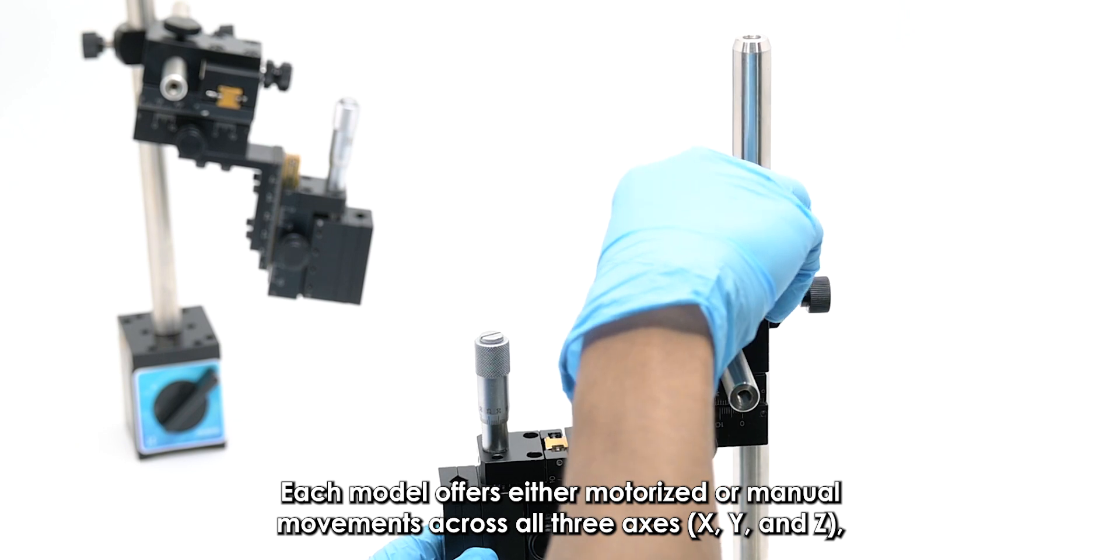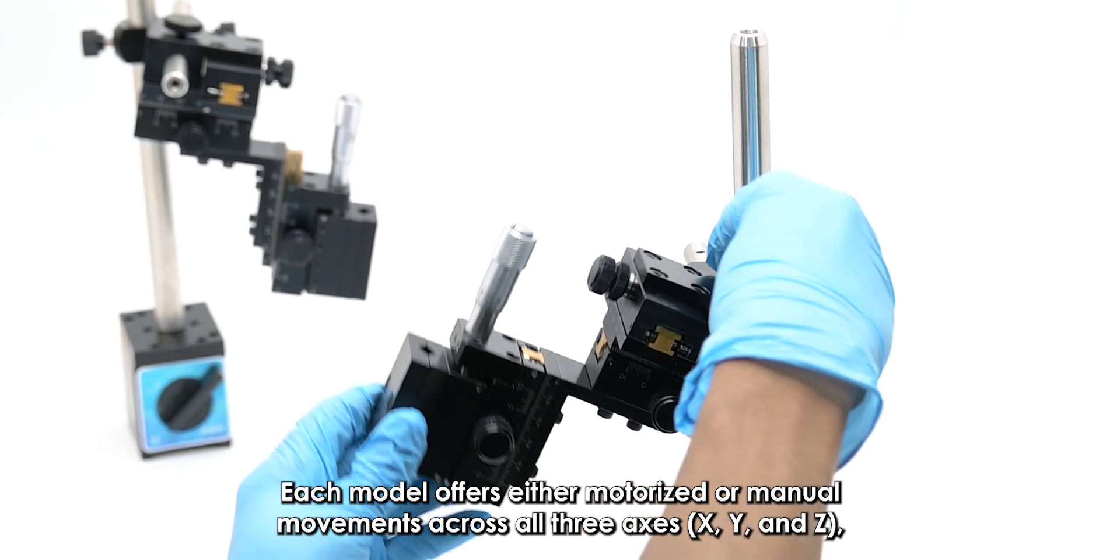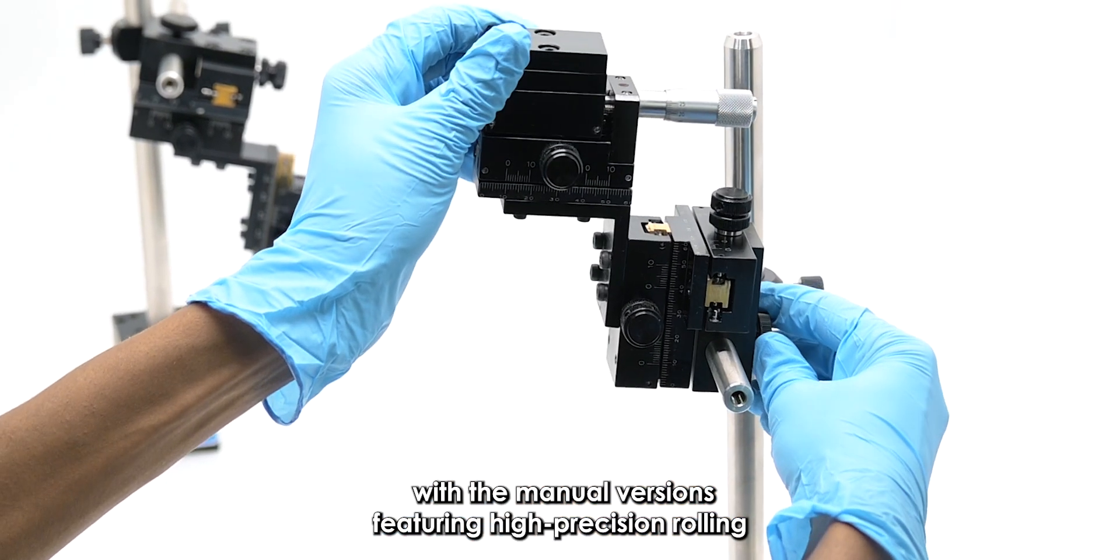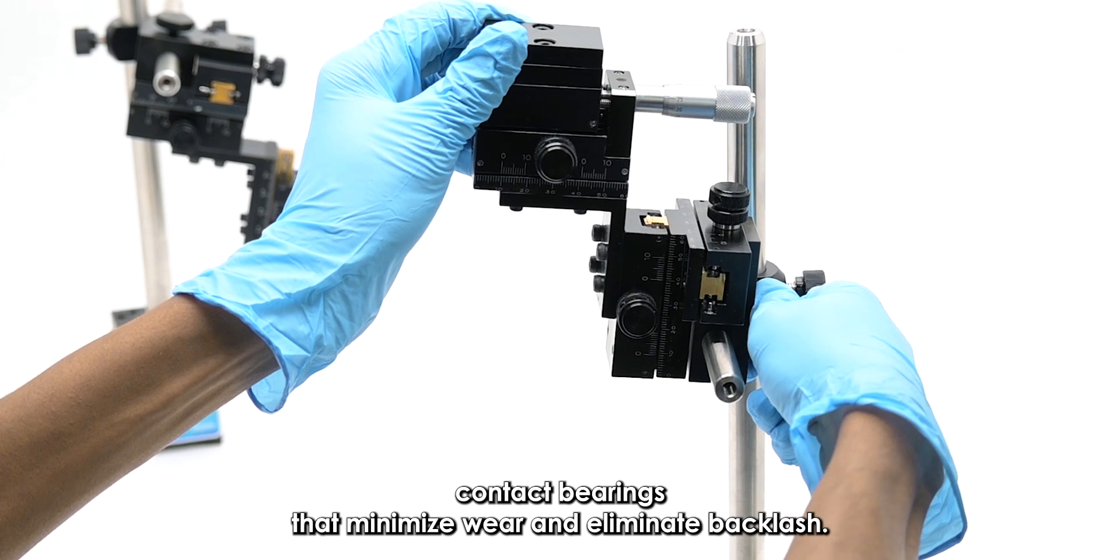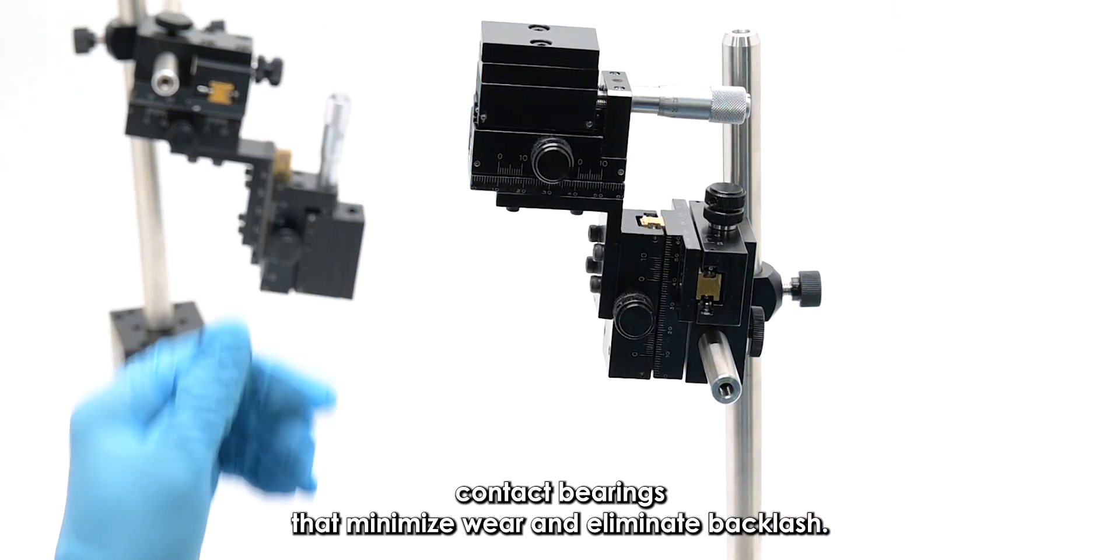Each model offers either motorized or manual movements across all three axes, with the manual versions featuring high precision rolling contact bearings that minimize wear and eliminate backlash.